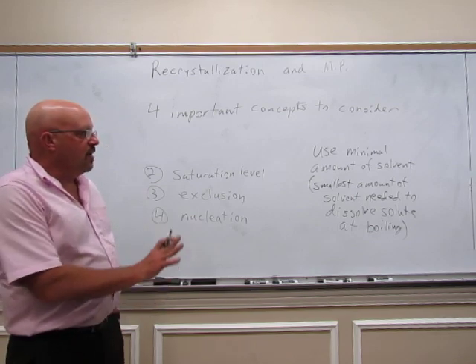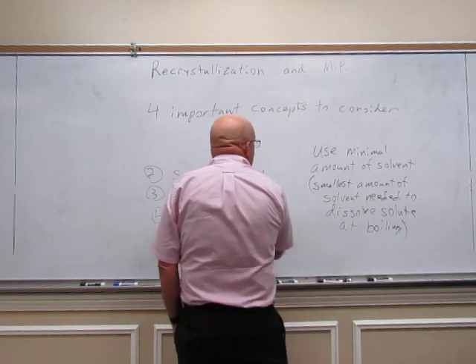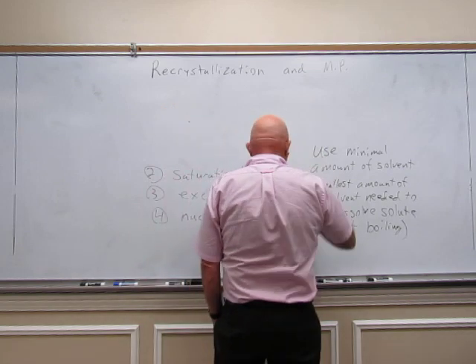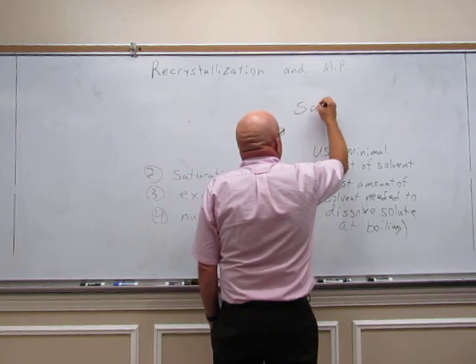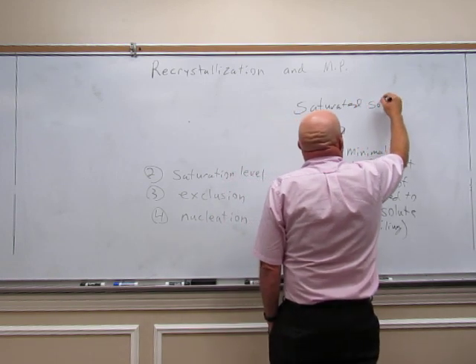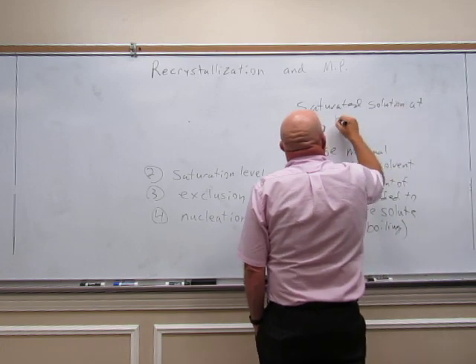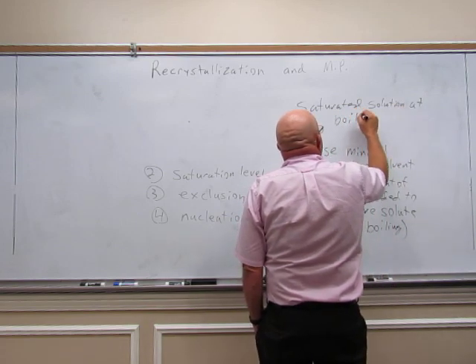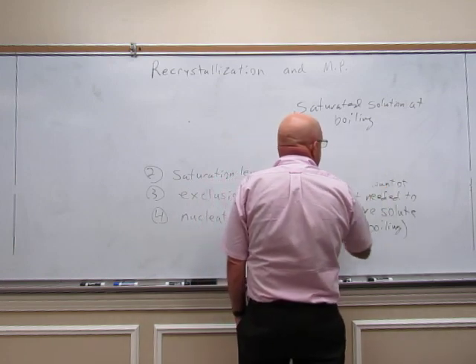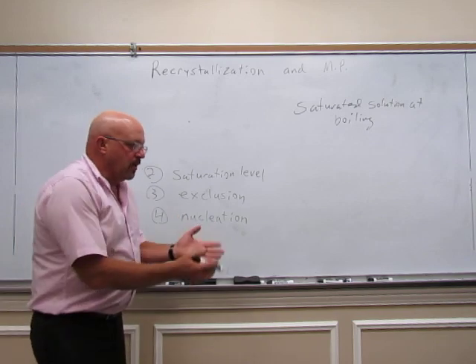We've got no extra solvent, so it's a saturated solution at boiling.